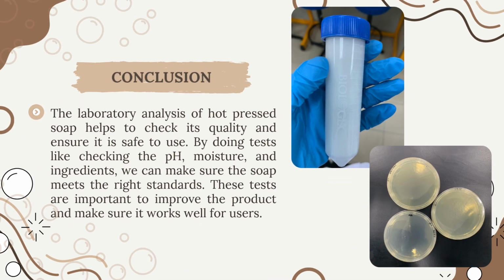In conclusion, lab analysis on hot press soap helps us check its quality, safety, and effectiveness. It ensures the soap meets the right standards and is safe to use. These tests also help improve the product for future use.